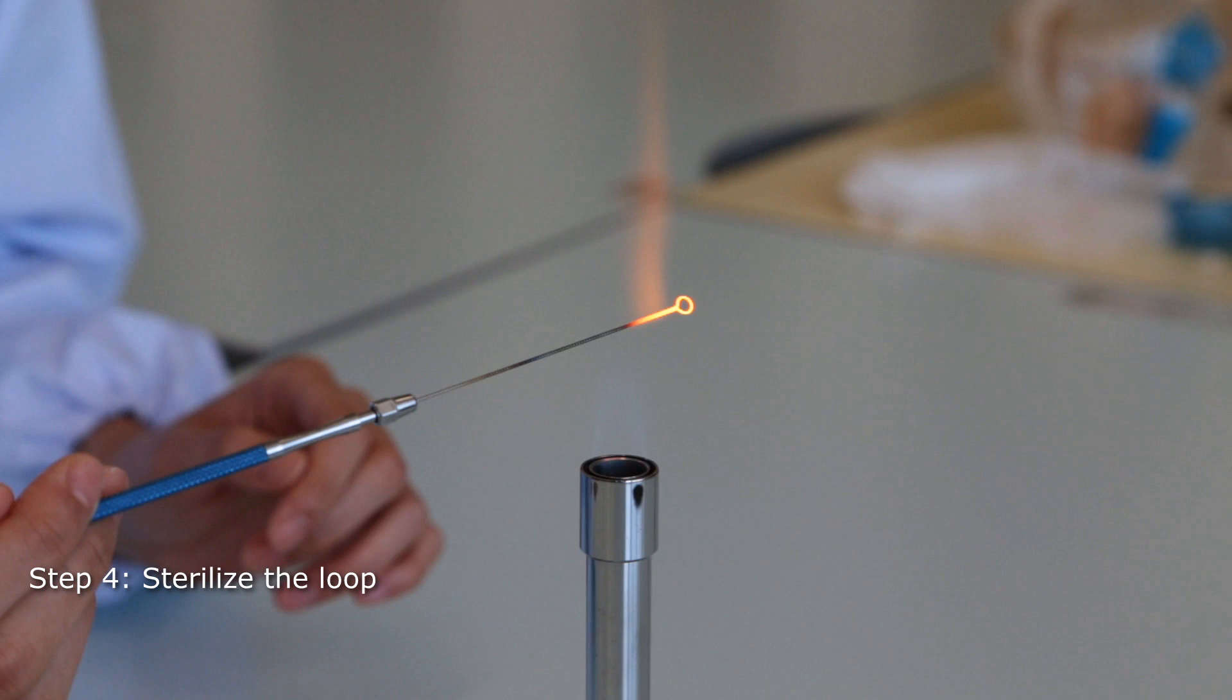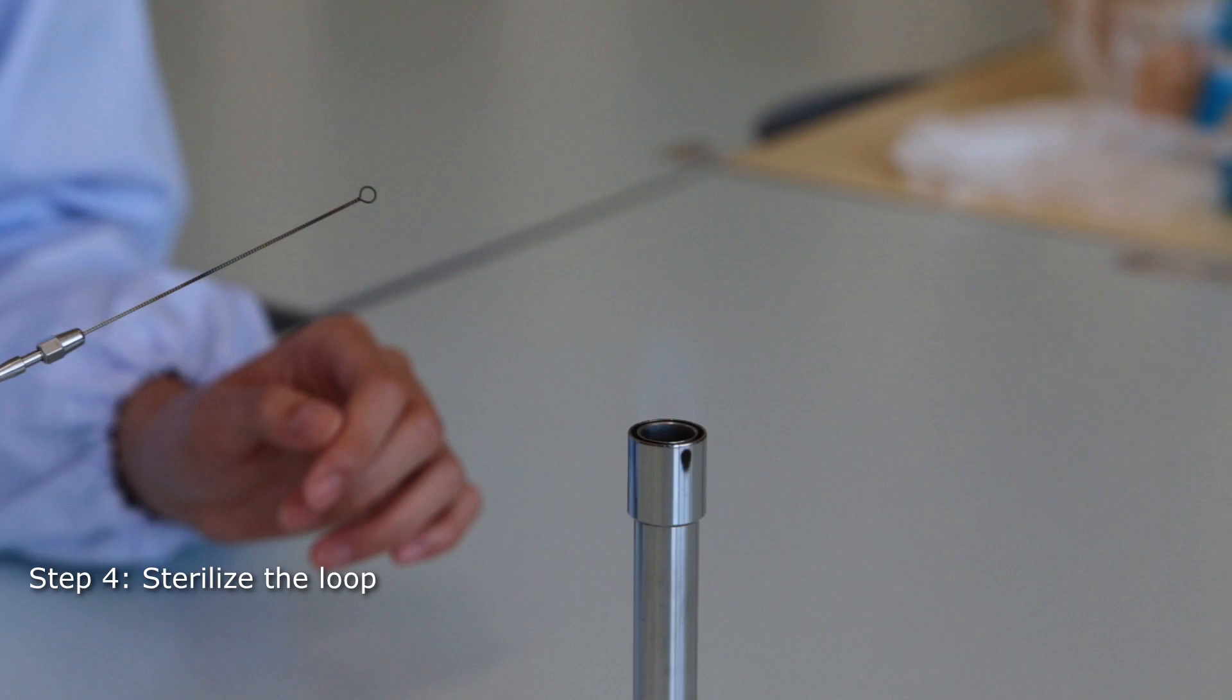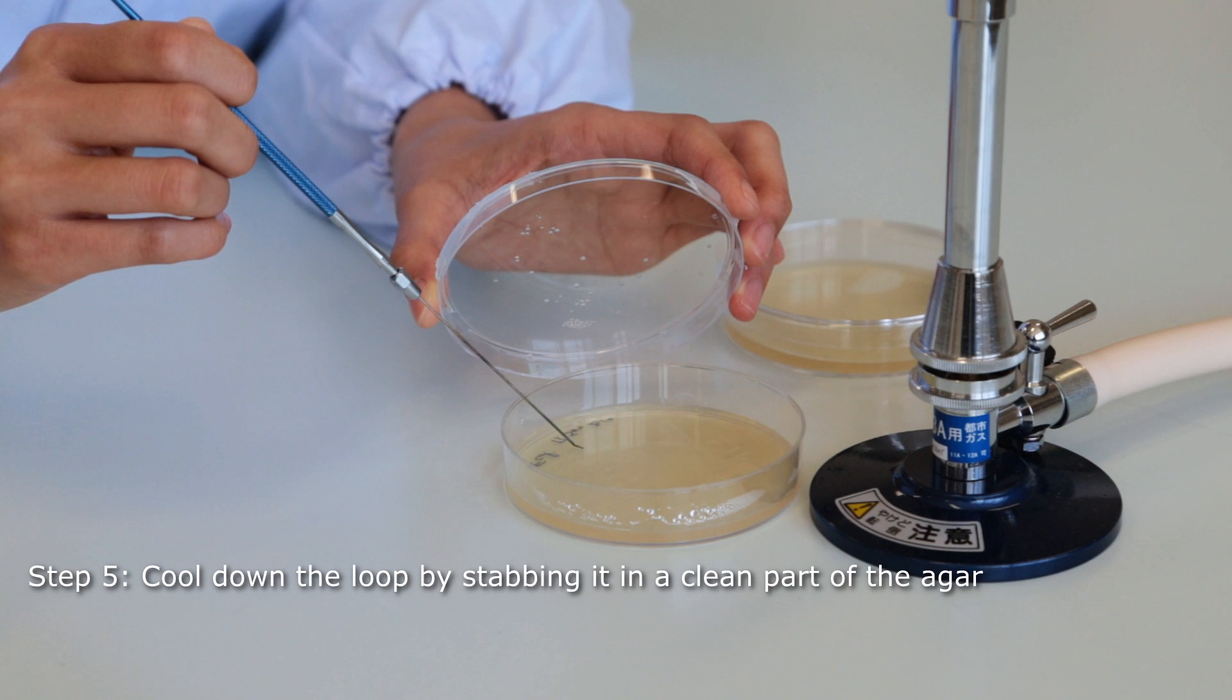Sterilize your loop in the flame. The hottest part of the flame is located just above the tip of the blue cone. Let your loop cool down. To ensure proper cooling, stab your loop in a clean part of the medium once or twice.